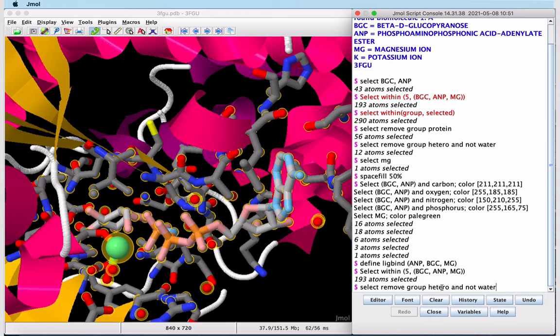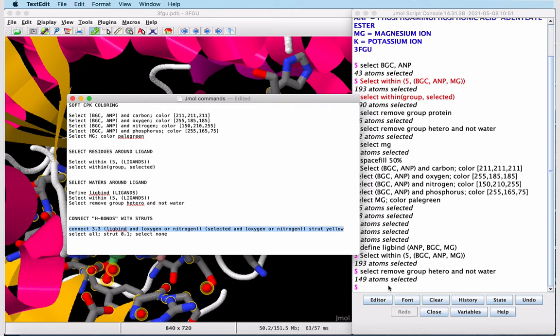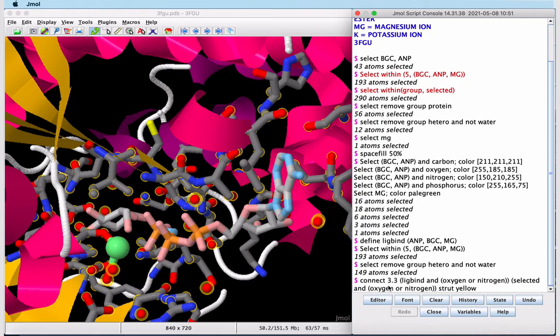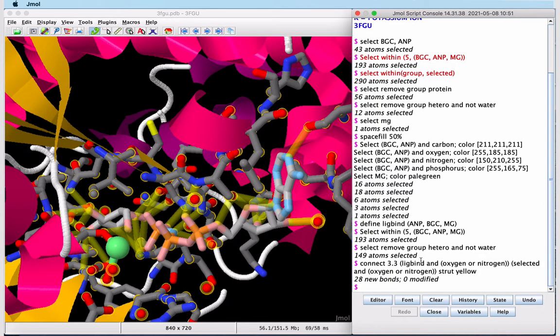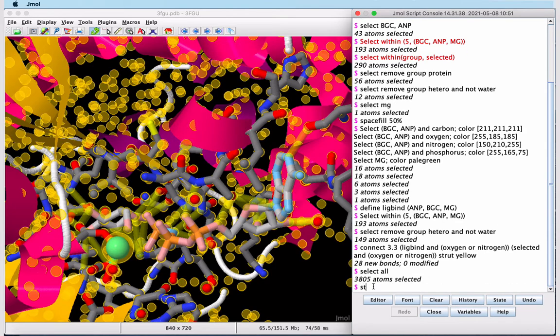We want to remove the ligand atoms from this selection as well. We'll remove the hetero groups, but not water. What we're doing is creating a selection around ligbind that'll allow us to connect the nitrogen and oxygen atoms to show probable hydrogen bonds. This is a long command, so I'll use the cheat sheet. And we've connected oxygens and nitrogens to surrounding oxygens and nitrogens which are within 3.3 angstroms. This is hydrogen bond distance.